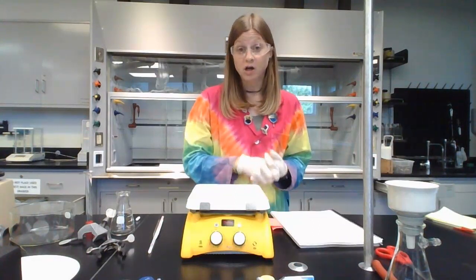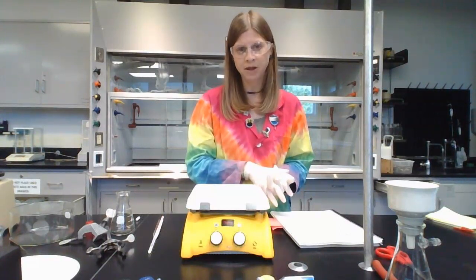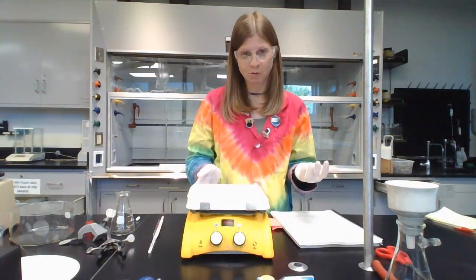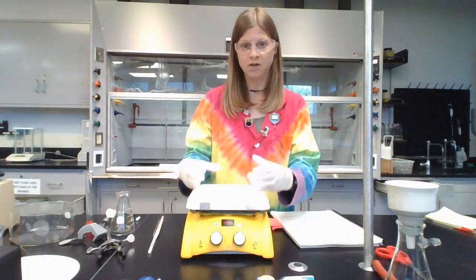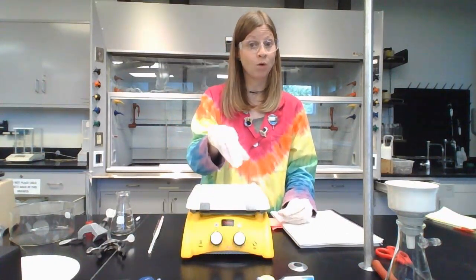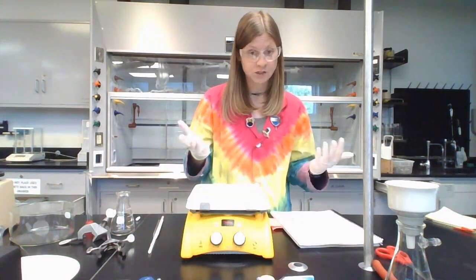So starting off, when we heat things in organic chemistry, we don't get to put them directly on the hot plate because most organic chemicals are flammable. So we don't want them super close to the heat source. Instead we make a water bath, and we put the water in the container on the hot plate, and then we submerge our solution that we need to warm into that water bath, giving it that buffer where it's not directly touching the heat source.